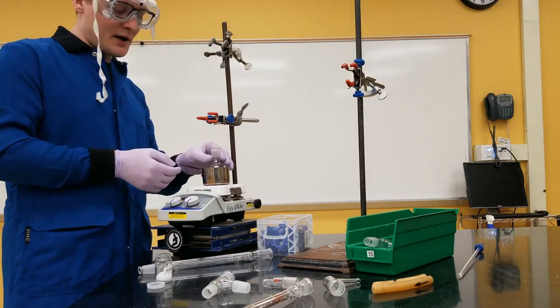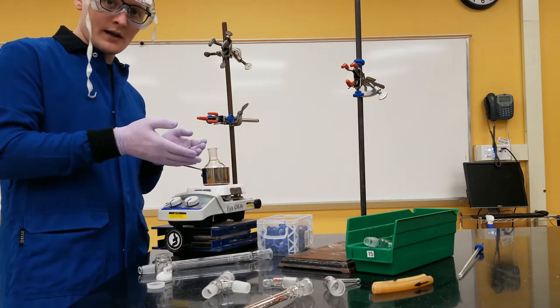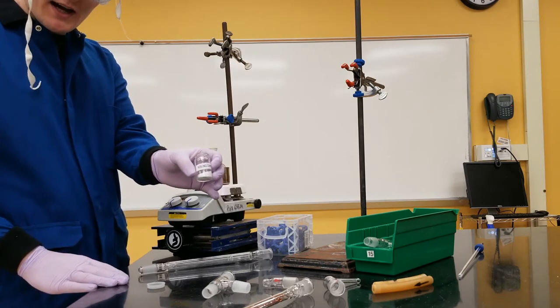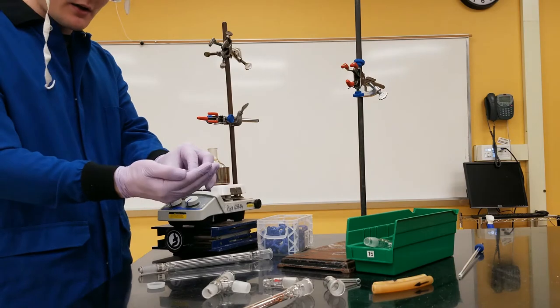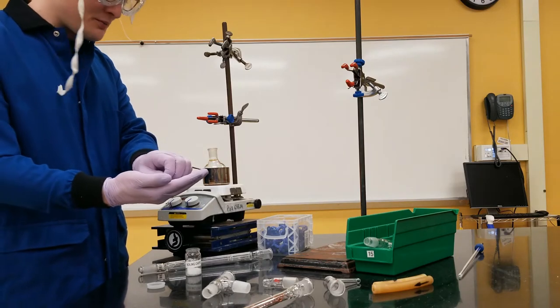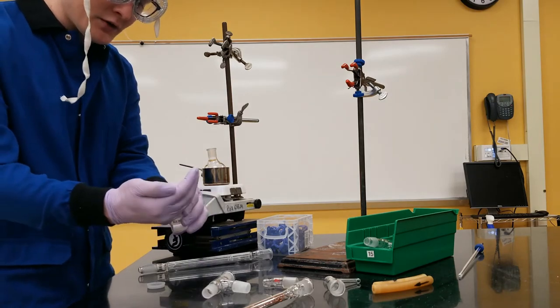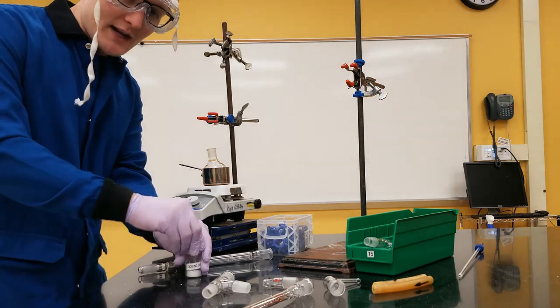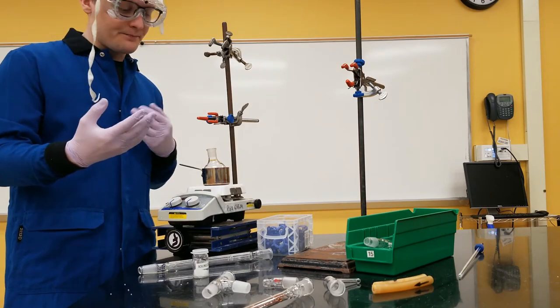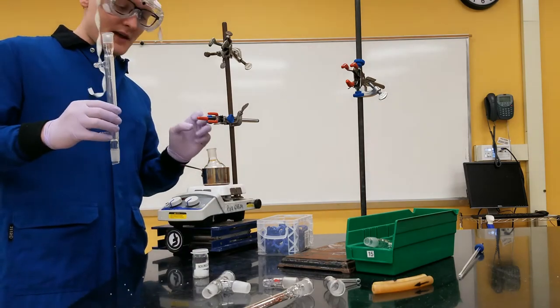Solvents in, a little sand at the bottom, and get this hot. And then the solvents are going to start evaporating in this setup. I'm going to add a boiling chip, which is just a tiny little shard of silica or alumina or some kind of inorganic compound. That's not going to mix with the solvents or affect them at all. But they're these tiny little jagged crystals, and they encourage the formation of tiny safe bubbles instead of big exploding popping ones. So that's why we have boiling chips. So we've got a nice safe boil going on here.